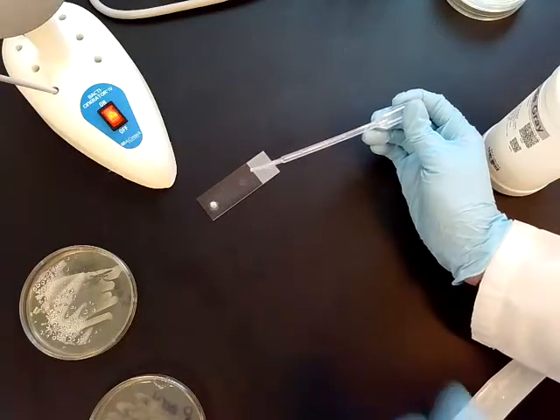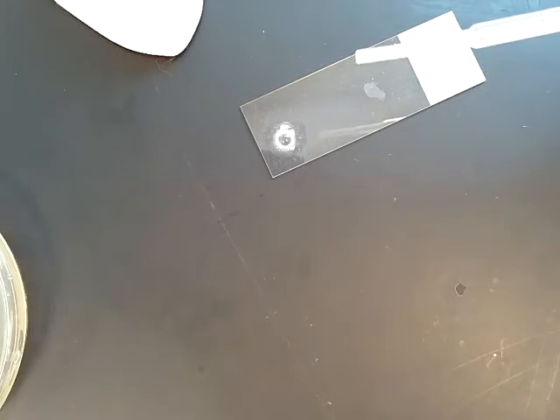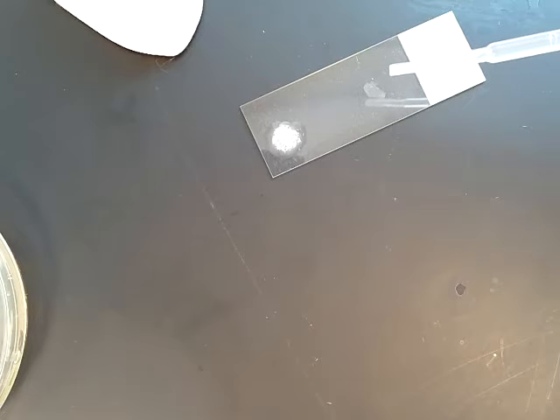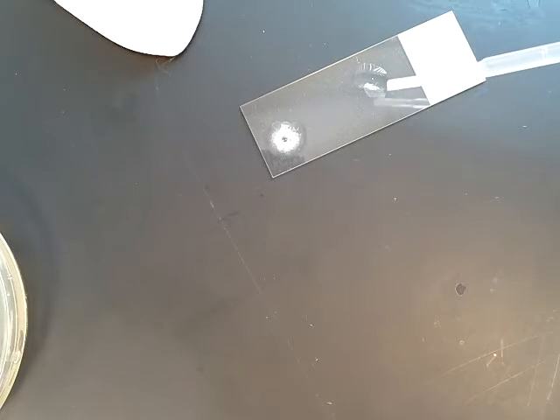You can see the bubbles. Now I'll bring this a little bit closer so you can see. Instantly the bubbles are forming. That one is catalase positive. And you can see bubble formation on this one as well, and that one is also catalase positive.